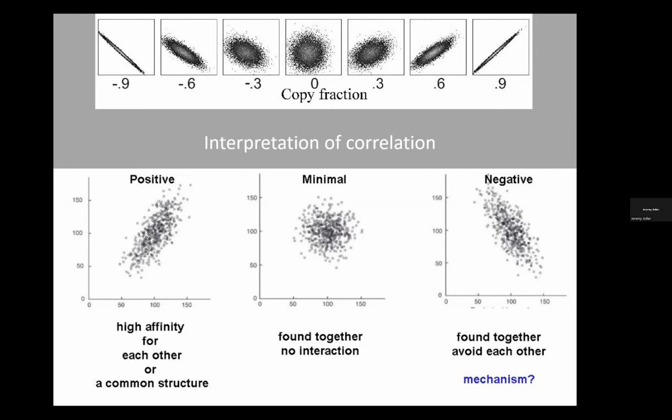When we're testing coefficients, when we're looking at whether our measurements are correct, what is very useful is to generate sets of data where you know precisely what is going on, which is what's done in this case. We have some ground truth data sets. We can see this is quite a strong negative correlation. This is a strong positive one. And then in between, we can generate different strengths, with 0 being no relationship at all. This is then useful to test against any measurements you make. This is a ground truth. What is the measurement? Does it actually reinforce the truth, or does it report something different, which we'll find later happens?